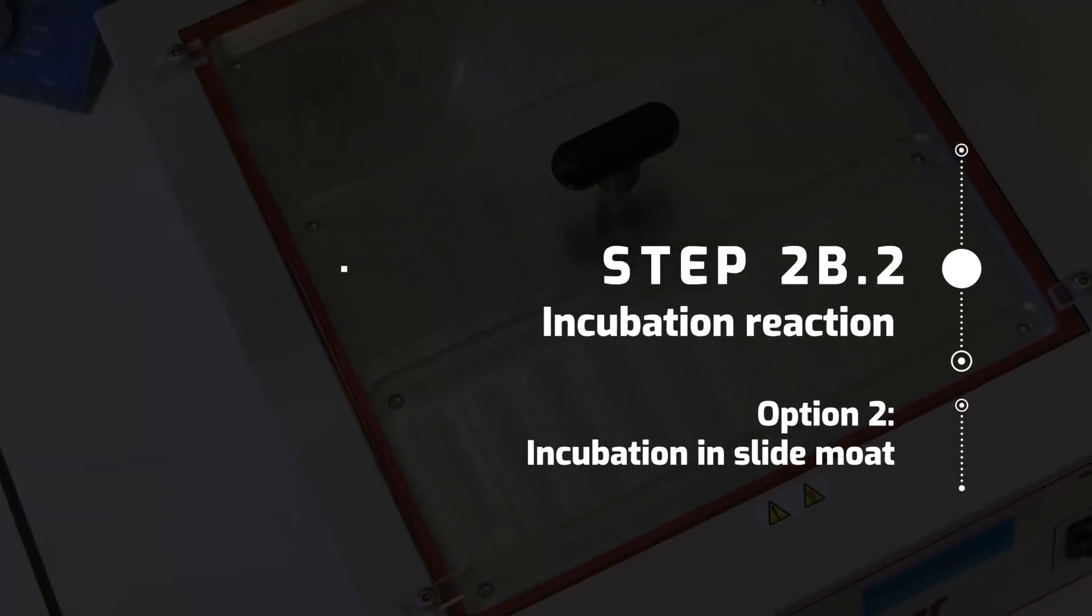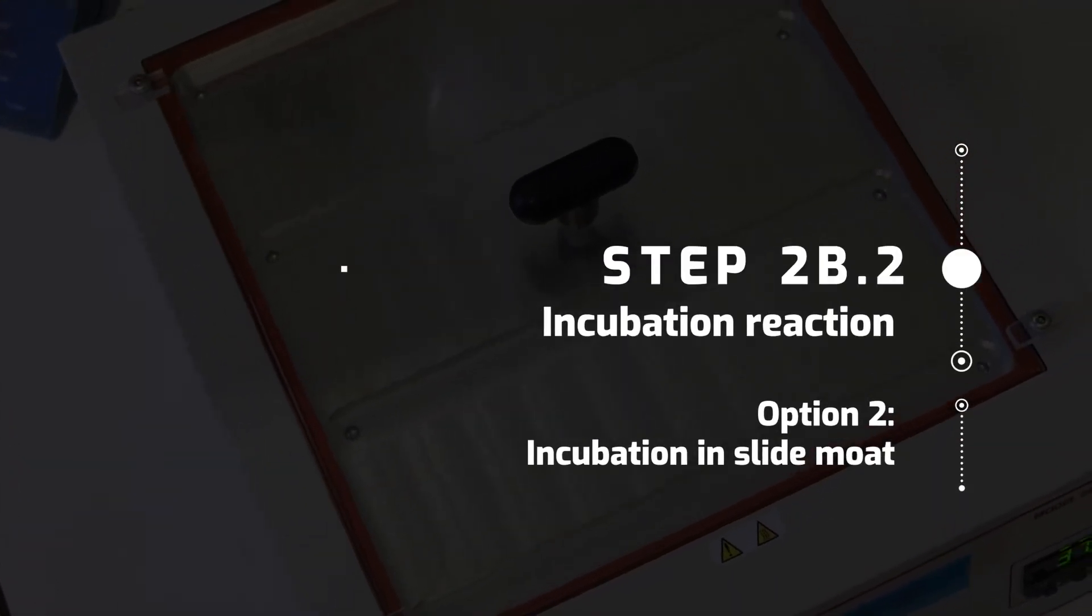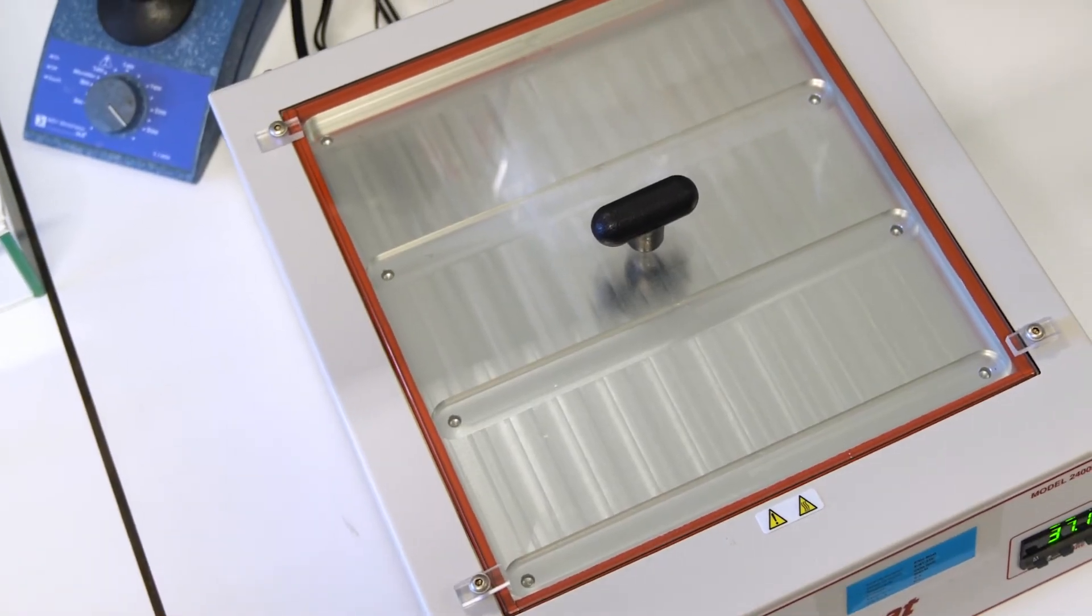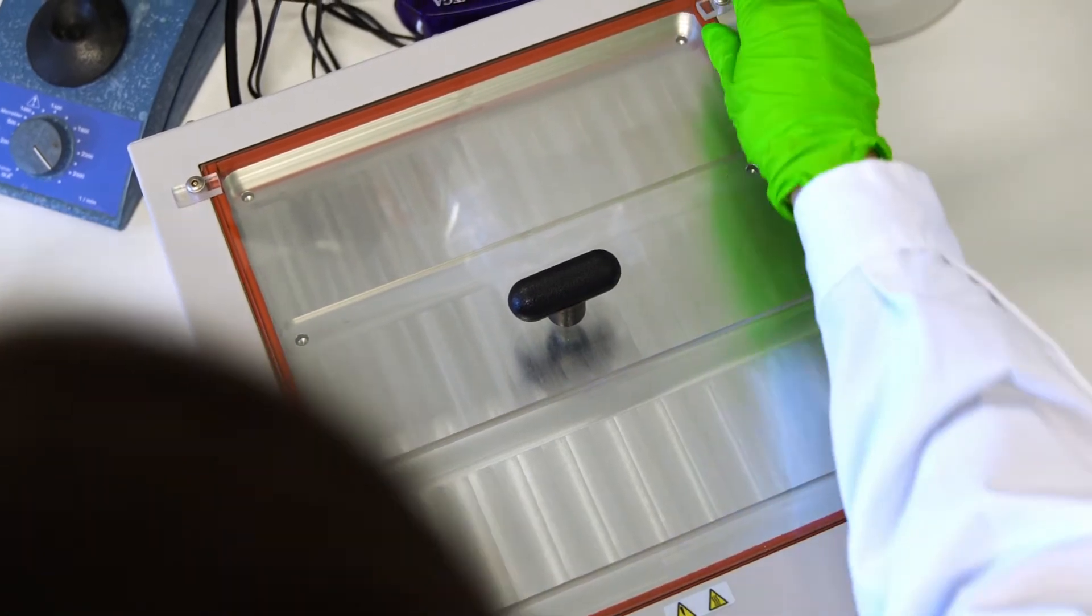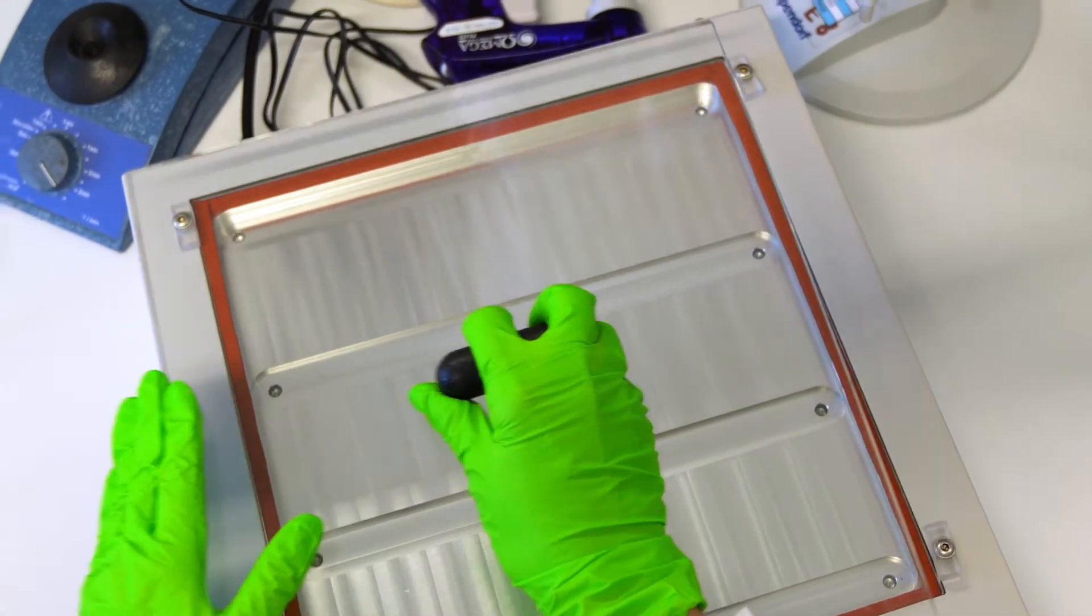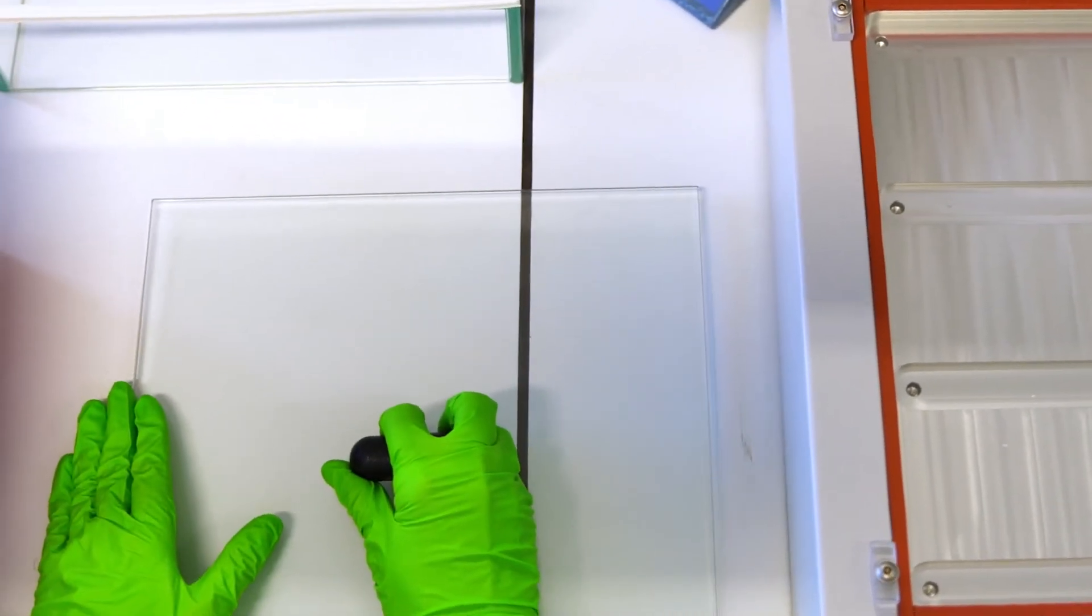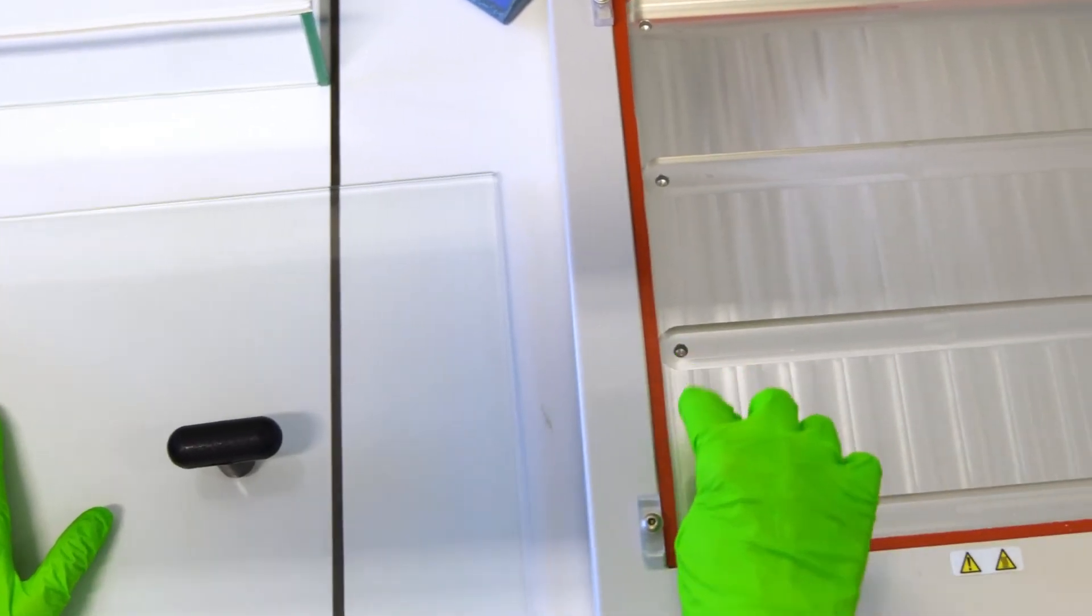An alternative system you can use is a slide mode. You can remove the lid and there are several holes in the grooves. In these holes you can put some water to keep the moisture inside the chamber.